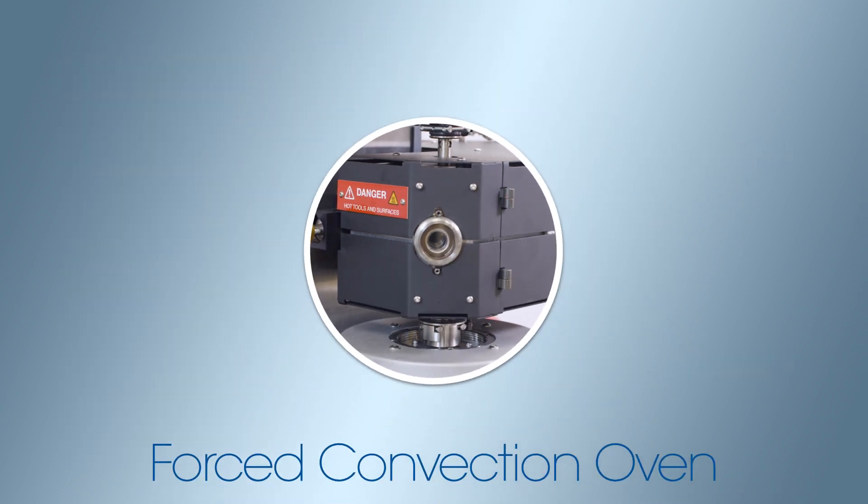When mounted on the ARES-G2, the cantilever clamp is used in tandem with the forced convection oven for temperature control.